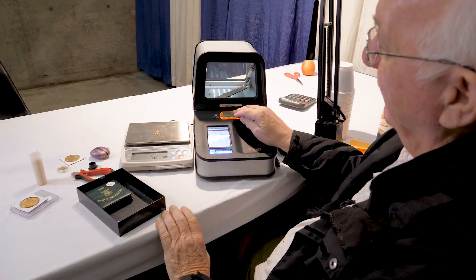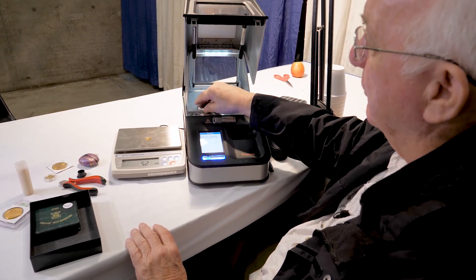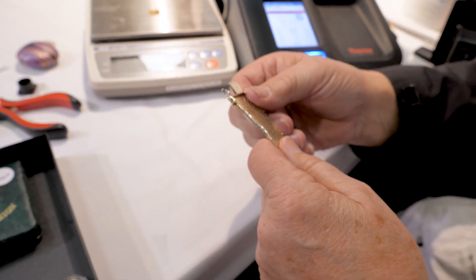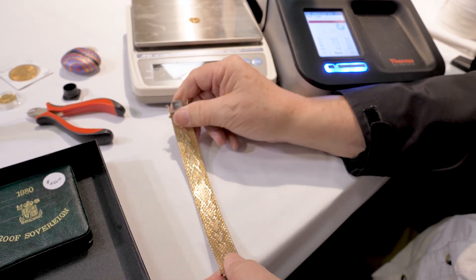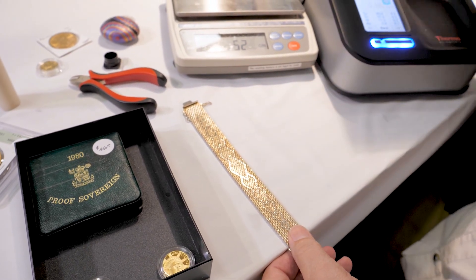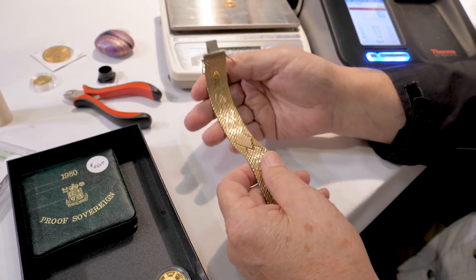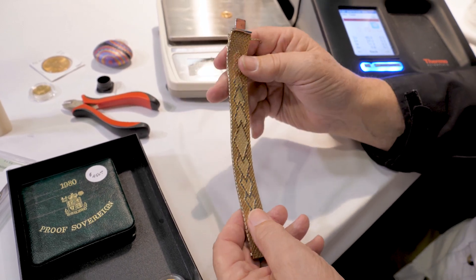So whenever buying jewelry — at a jewelry store, trade show, wherever — always check. Don't take the salesperson's word for it. Anybody can go down and buy a $20 stamp, put 18 karat gold on it, and sell it to you as 18 karat gold. When you're shopping at Chemfair, you can rest assured 100% of the jewelry you buy is what it's purported to be. You can double check it right here anytime, free. You can even bring some of your own jewelry in if you have questions. If time permits, we do complimentary gold testing on your heirloom jewelry. Beautiful piece — but not 18 karat gold.